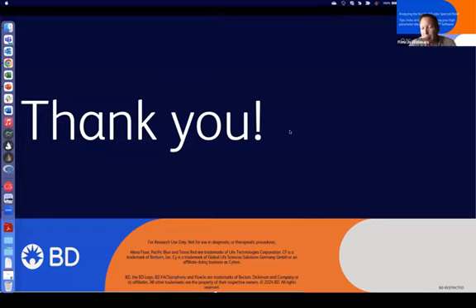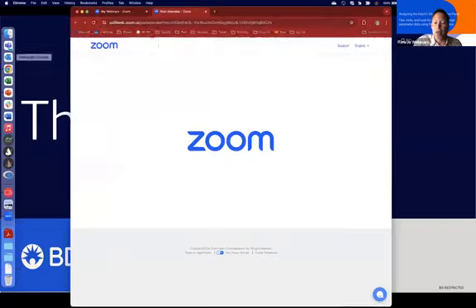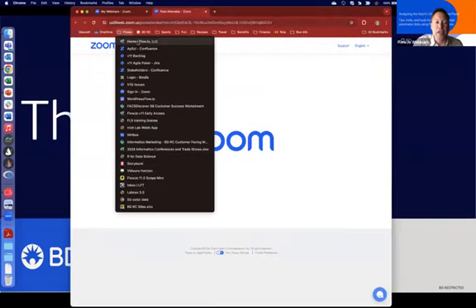Which one do I recommend? So first, if you can avoid using a batch correction tool by just carefully QCing the equipment and making sure everything is kept as similar as possible and the negative falls into the same intensity, et cetera, do that. If you have to do batch correction because there's batch correction needed in your data, you can also pull up the graphics here as I'm talking about these on flowjo.com/exchange.